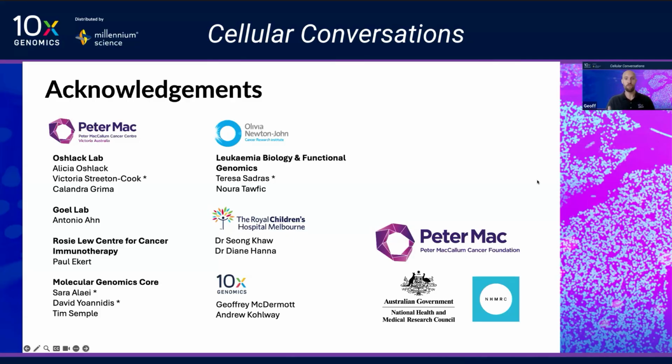And beyond fusions as well, you mentioned other weird species. I should note that I have had people do this for, say, viral transcripts, which is another common reason to spike in viral probes in both our single cell and spatial products. Bacterial transcripts, to some degree, I have seen it done successfully in both single cell as well as spatial platforms too.